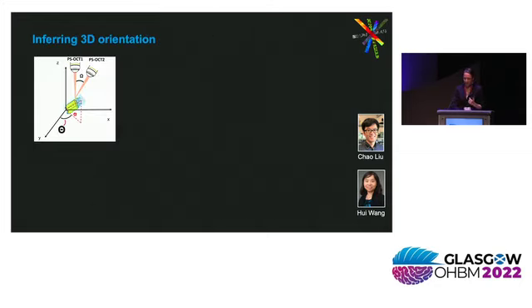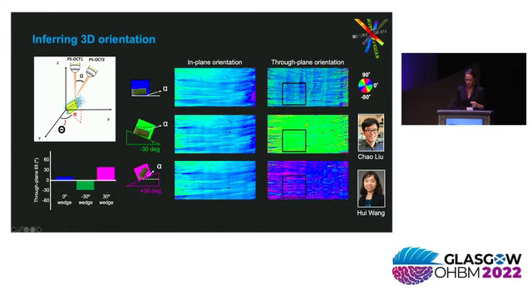Another key limitation up to now was that we could only get in-plane orientation measurements. So the color maps that you saw are the orientation of the fibers in the plane perpendicular to the angle of incidence of the light. This can be fixed by having 2 light incidence angles and collect twice as much data, or 3 times as much. And these preliminary results from Chao are very encouraging, and we're very excited about this new development.